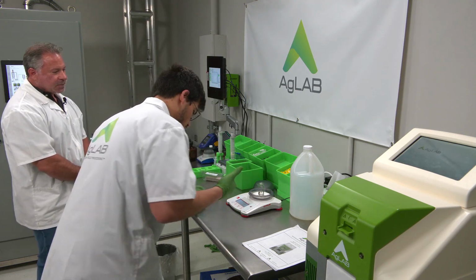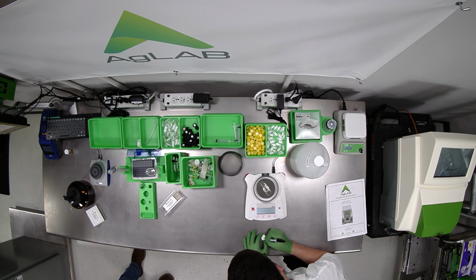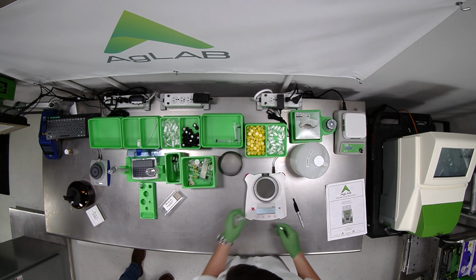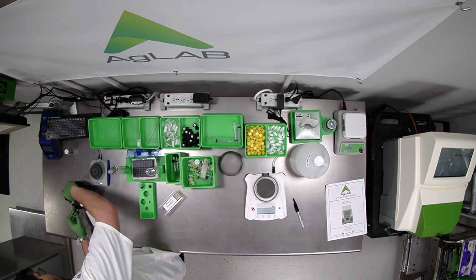Okay, so let's go ahead and record this weight. This is our D1 vial for tails, and we have 0.028 grams. And this is our first tail sample. Okay. Same volume for all sample types. It's always going to be 10 milliliters. That's never going to change.